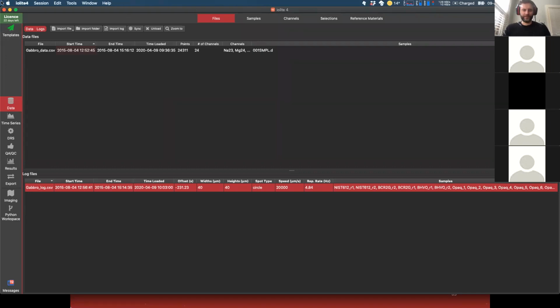Yeah. Hi, can you hear me? Yeah. Thanks, Bence, for the illustration. I just want to ask something about the primary channel that you mentioned before. You mentioned that the channel that is currently selected will be primary, right? Yes. So if I want to zoom in or out, the selected one will be changed.